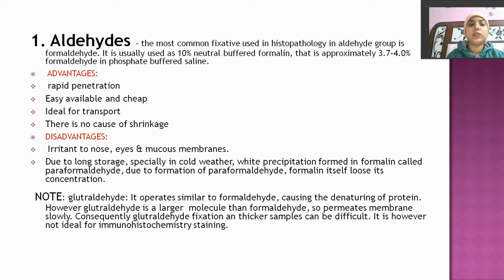Here are the disadvantages of aldehydes. They irritate the nose, eyes and mucous membranes a lot. Sometimes, due to long storage, especially in cold weather, a white precipitate called paraformaldehyde forms in formalin. Formalin itself loses its concentration.